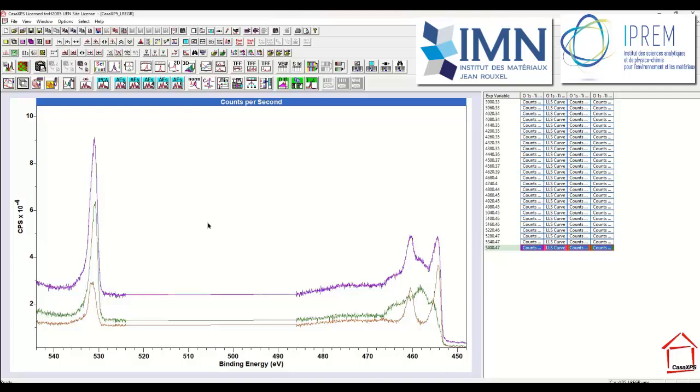Now this is not the end of the story, this is just the beginning, because what we would like to do is carry on analysing the rest of the data set, finding other shapes that are plausible. We certainly have a metallic form that is very plausible because it's our initial state, so that ought to be included in the calculation. So we keep adding spectral shapes to the calculation, performing the same sort of analysis that we see here until we end up with a set of component spectra that give us some insight into what's happening as this titanium oxidizes.